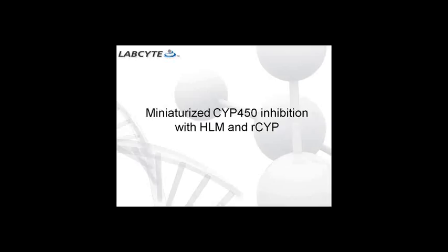For assay development, we chose to test CYP3A4 activity with luciferin-IPA as a substrate for proof of concept purposes. CYP3A4 is probably the most important CYP enzyme in drug metabolism. It consists of greater than 30% of the total CYP in the human body. The enzyme is involved in metabolism of approximately half of the drugs that are used in humans today.